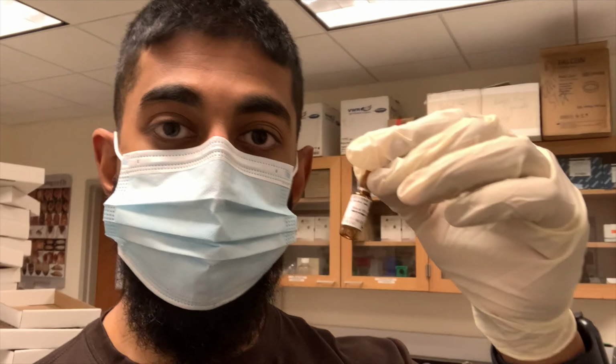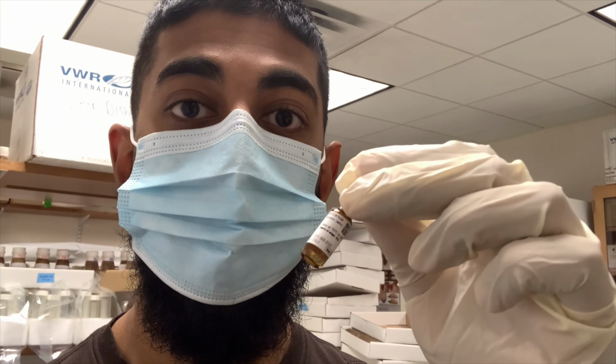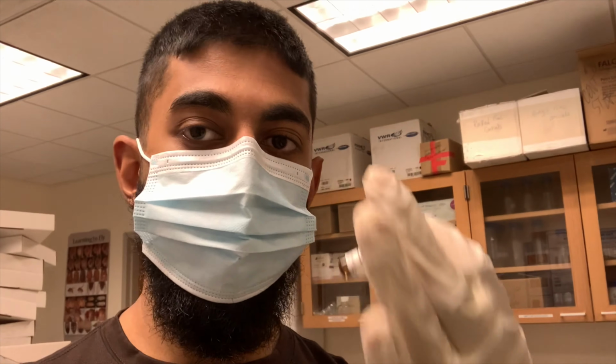This right here is formaldehyde solution, one of the few things that we work with in this lab. We have to wear gloves while working with it because it is a known carcinogen. If it enters our bloodstream through a break in our skin, it could lead to cancer. So while working with it, we take all the necessary precautions, which in this case is wearing gloves.